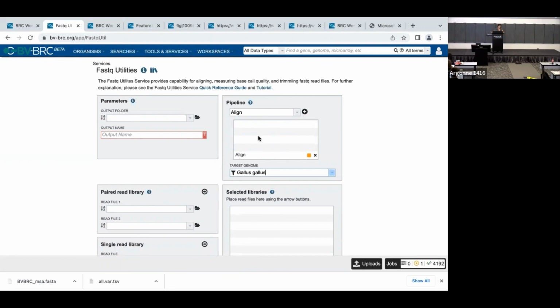So there's always a way to manipulate things the way you want. And sometimes I use the snip tool for things that it wasn't designed for, just because it gives me some of the things I want.